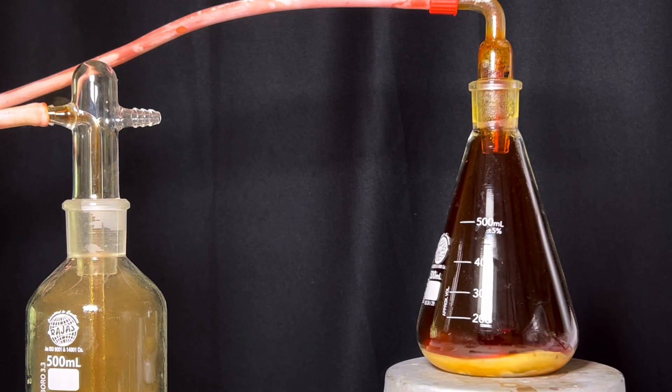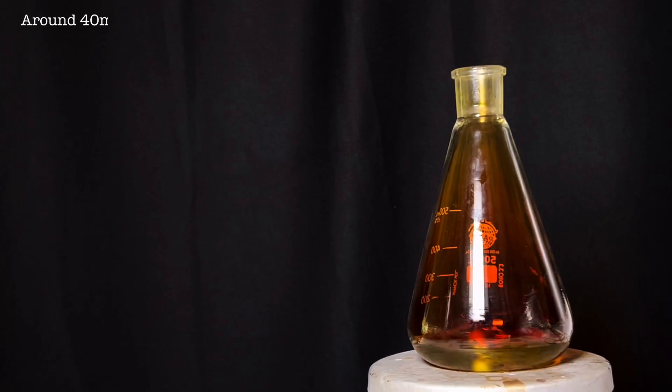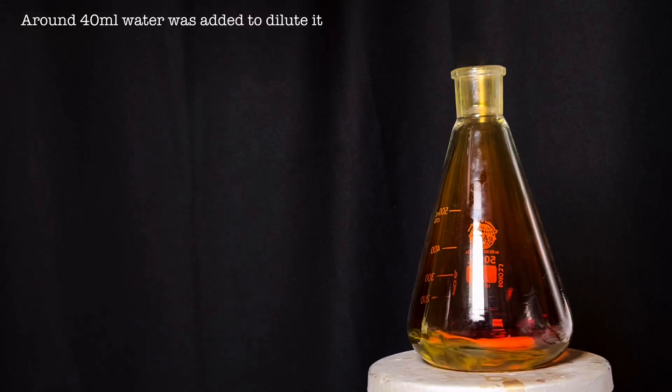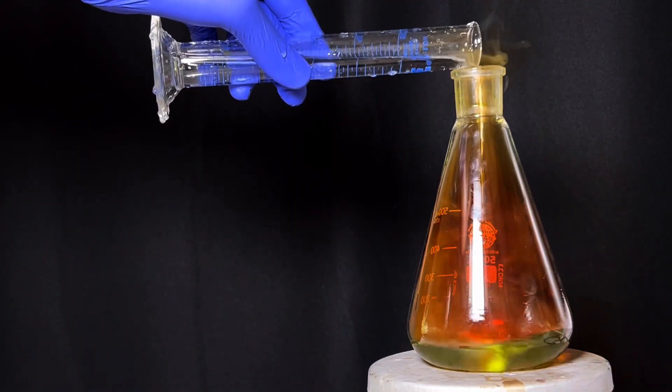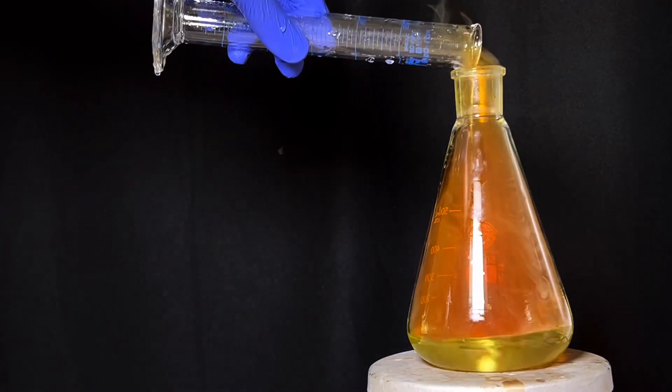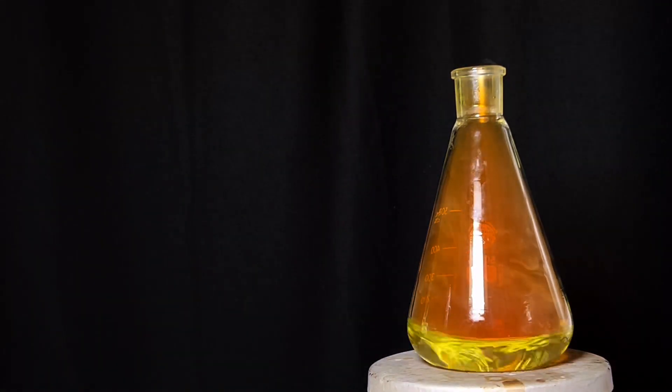Finally when the reaction dies down, the gas trap system was removed and around 40 milliliters of water was added to dilute it. Do not add too much water as this could make the bismuth oxy nitrate and this forms a white precipitate.